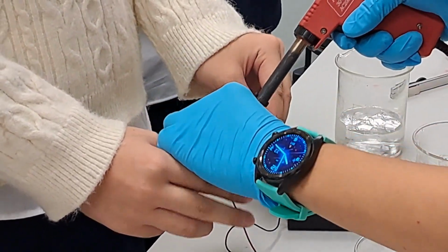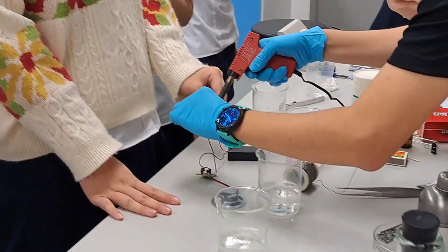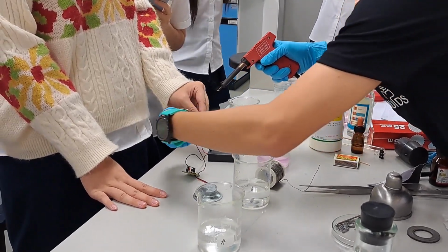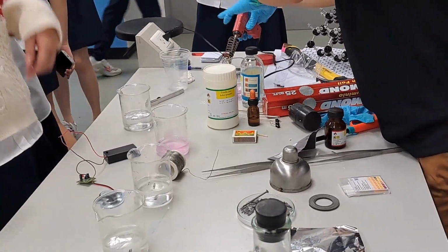Hold on a bit. No, not working. Excuse me. This one hasn't heated up.